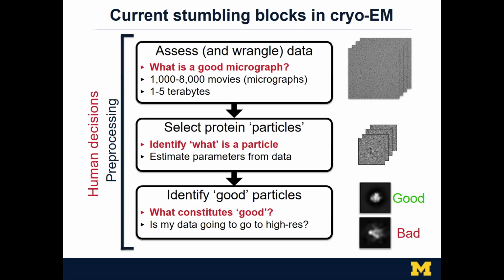And we think deep learning is the best way for this. First is that cryo-EM has a lot of data, so training data is not a big problem. And two is that deep learning models are best at abstracting human knowledge. So we can basically ask the experts to label the training images and try to bake such expert-level knowledge into a pre-trained neural network model.